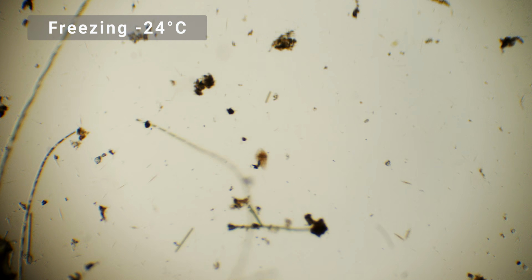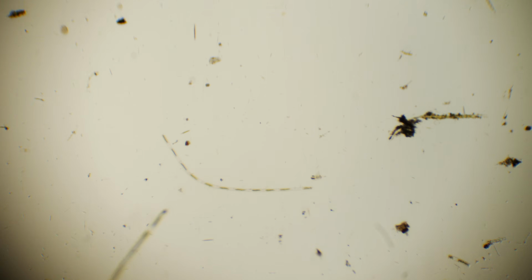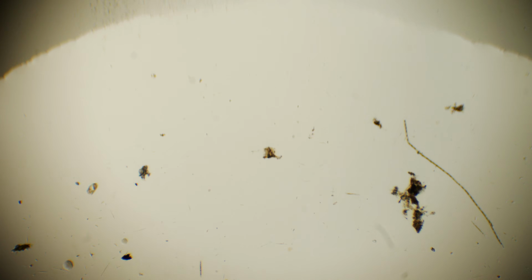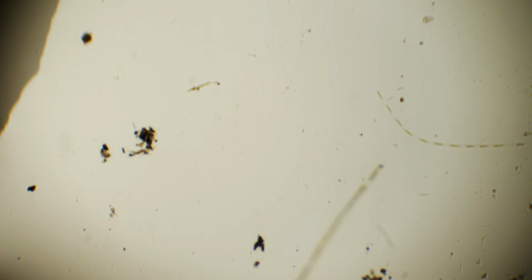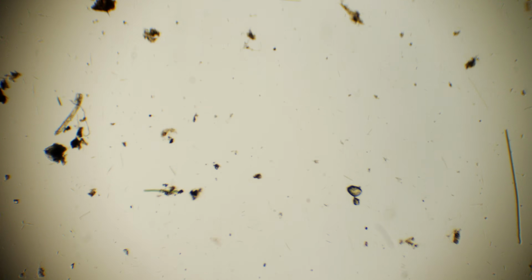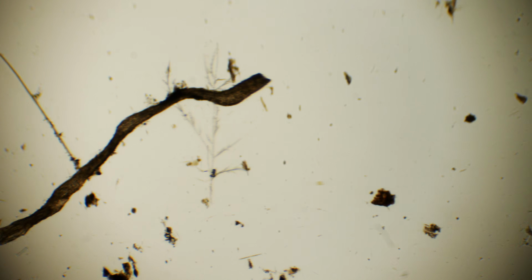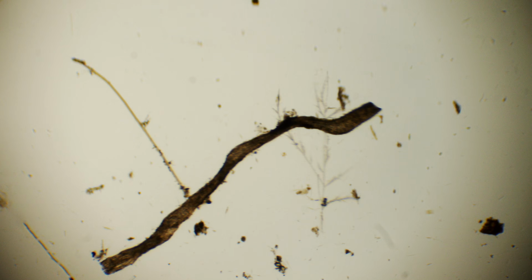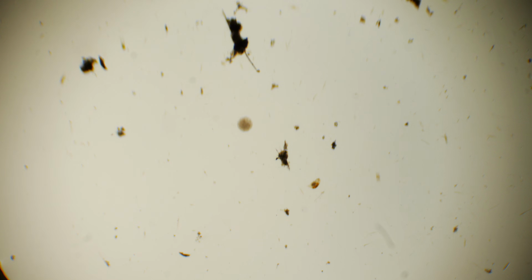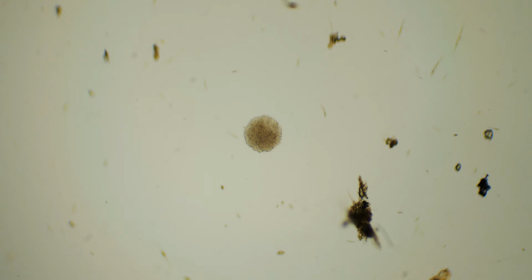And now, finally, we move on to the thawed water. This lake water was a solid block of ice a couple of hours ago, frozen at minus 24 degrees Celsius, about minus 11 degrees Fahrenheit. So far, I don't see any kind of life in this drop of water. Just like boiled water, thawed water contains a lot of debris, and logically, that debris will not disappear on its own. To clean water from living microorganisms, there are two of the most reliable methods: freezing and boiling. And the best option is to combine this with a filter.